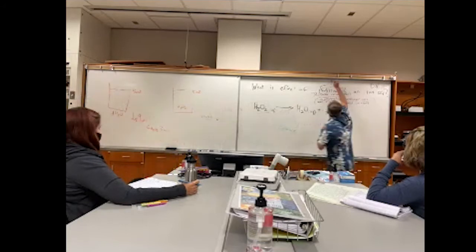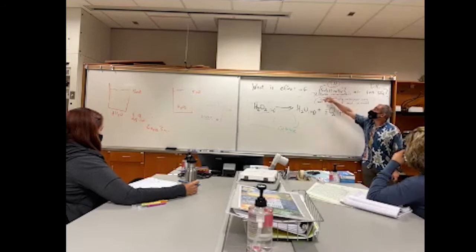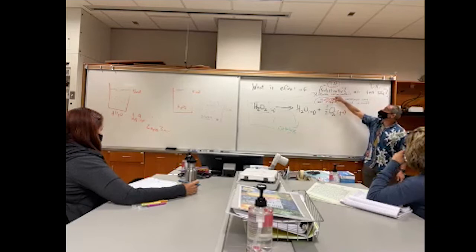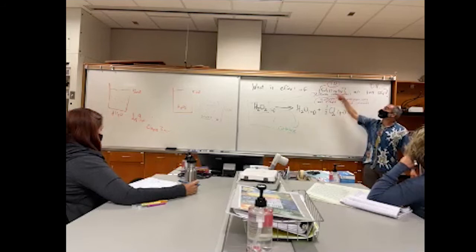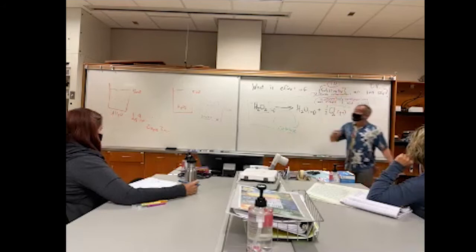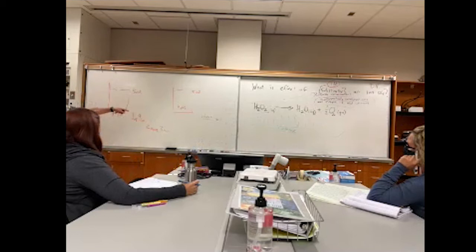So that's going to take care of our independent variable. We'll just create these different dilutions from 0 concentration to 100% concentration of hydrogen peroxide solutions that we're going to put into our reactor. Does that make sense? Measuring the independent variable is easy. We just mix up the proper proportion of water to hydrogen peroxide, and we've got our concentration for that particular trial.